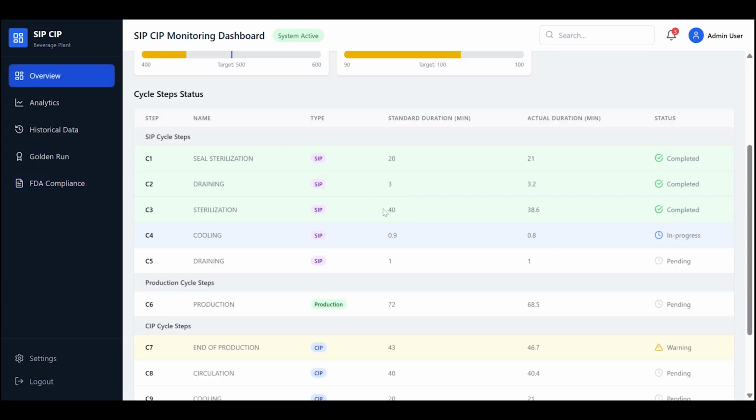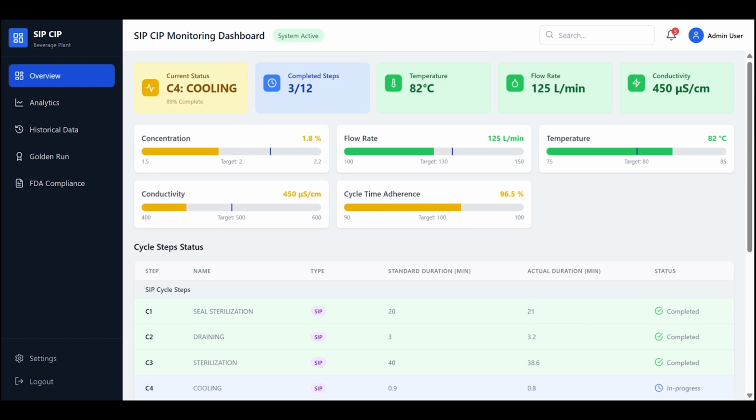As you can see, SymphonyAI IRIS Foundry brings data from various systems into one unified platform, allowing for real-time monitoring and simplified compliance reporting. With intuitive dashboards and automated insights, it empowers operators to spot issues early and stay audit-ready with ease.